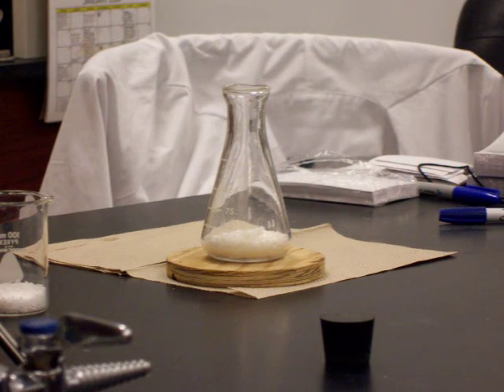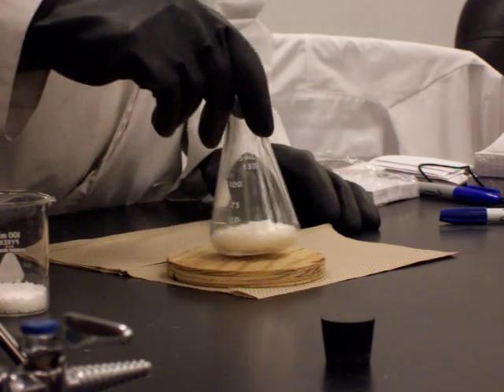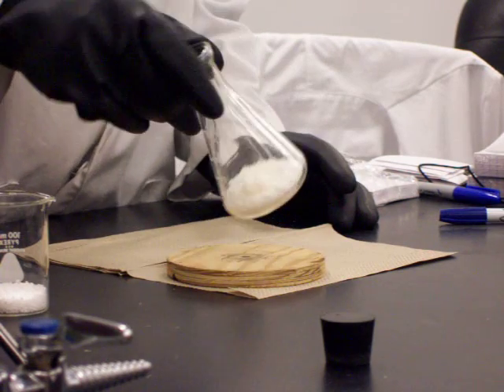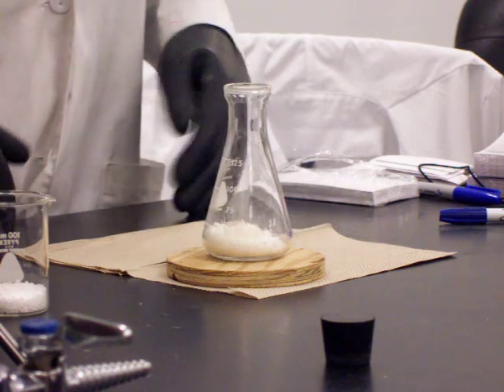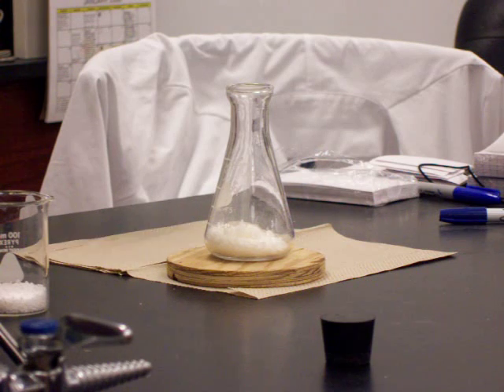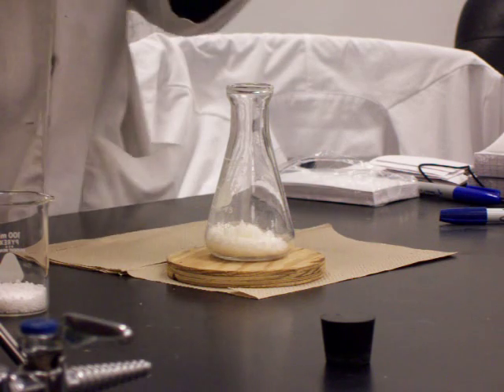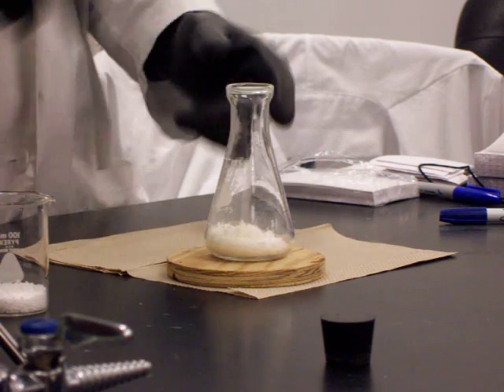The first reaction we're going to look at here is the endothermic reaction. I have in front of you two containers of white solids. The first one here in the Erlenmeyer flask is barium hydroxide. It is a hydrate, so there is water stuck inside the molecule — like when we did the copper sulfate lab that had the five waters in there. This one is an octahydrate, so it has water stuck in there.